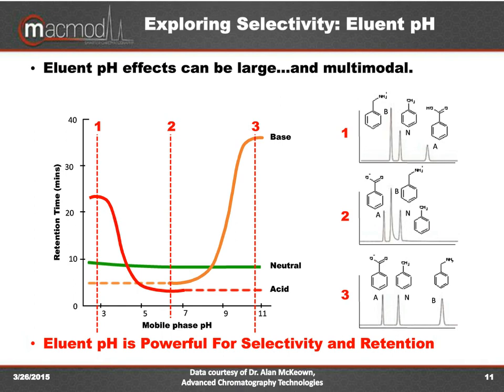So it's beneficial to be able to access more of the pH range for bases, neutrals, and acids. I, for one, have not had a lot of experience over my years of working in LC with the higher pH range, simply because there weren't a lot of good columns around that could handle mid to high pH. Now I believe we have some that can do that in the ultra-core phases.